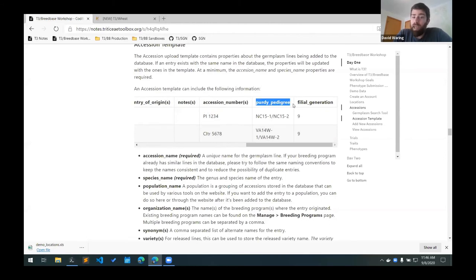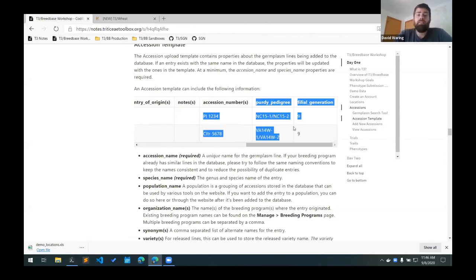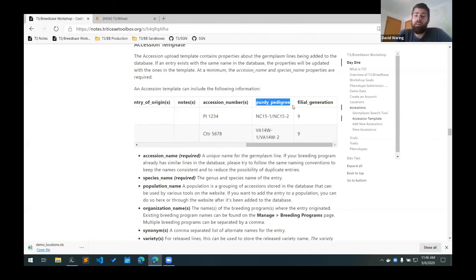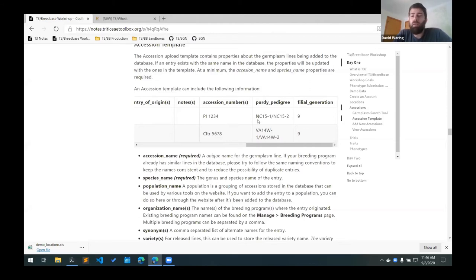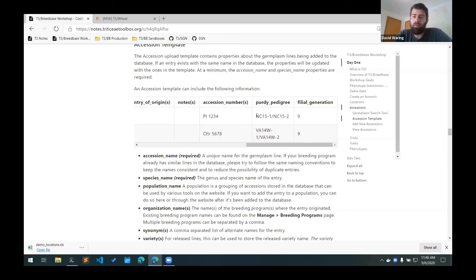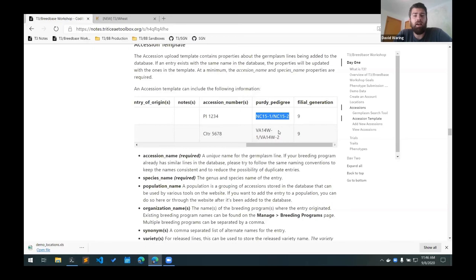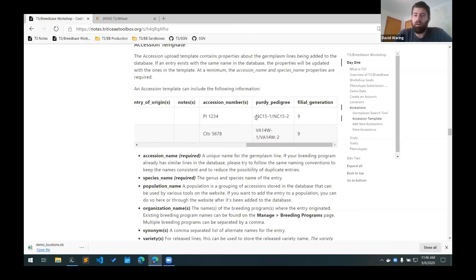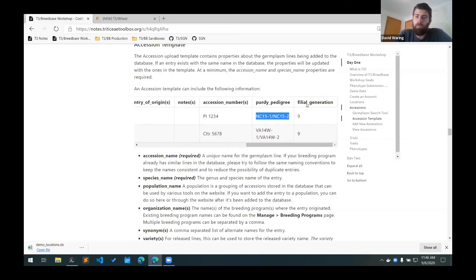And then we always want to have your Purdy pedigree. So if you have the pedigree string for the line, you can add that here. And at the moment, these aren't being parsed. So they're just stored as is as a text field in the database. So at some point in the future, we'd like to parse these, at least just a slash B lines Purdy strings, so that way we can have the interactive pedigree tool working. But for now, they're just stored as is in the database as a text field. And then you can also add the filial generation.